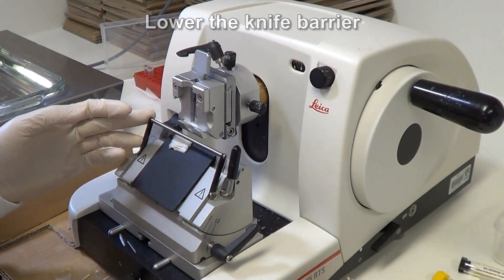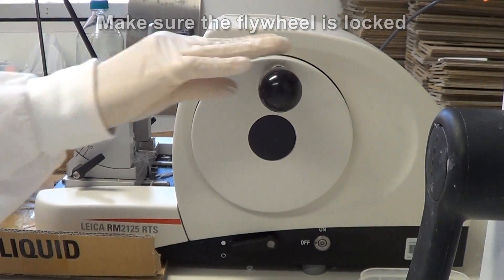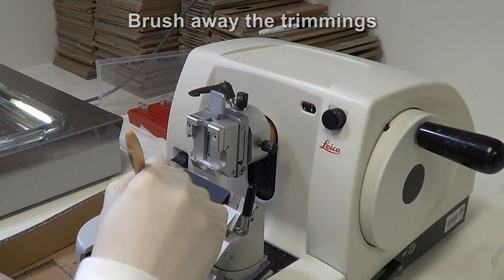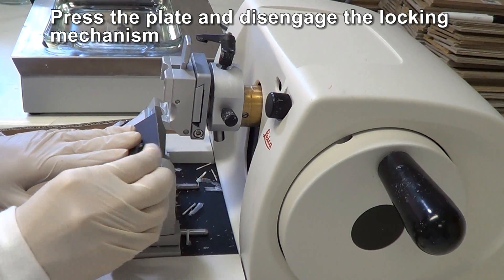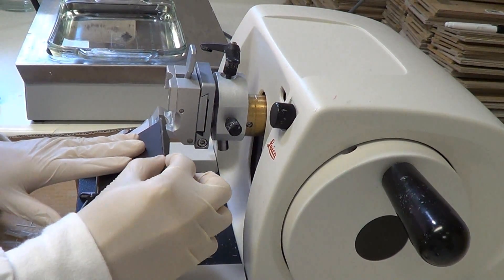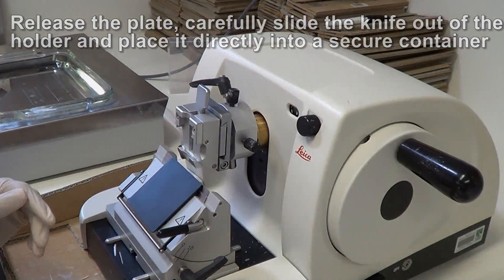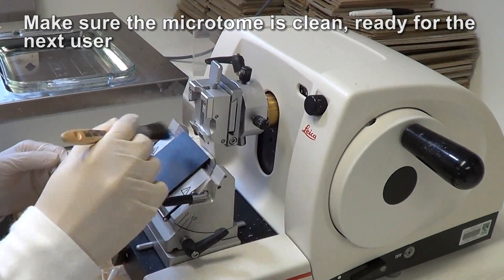Lower the knife barrier. Before removing the blade, make sure the flywheel is locked. Brush the trimmed material off the plate using an upward motion. To disengage the knife, press the plate and lower the lever of the locking mechanism. Carefully slide the knife out of the holder and place it directly into a secure container. Finally, make sure the microtome is clean and ready for the next user.